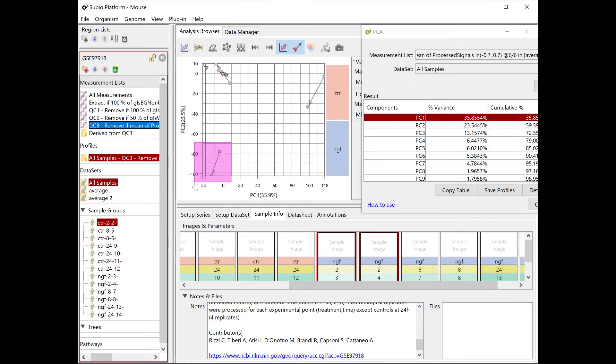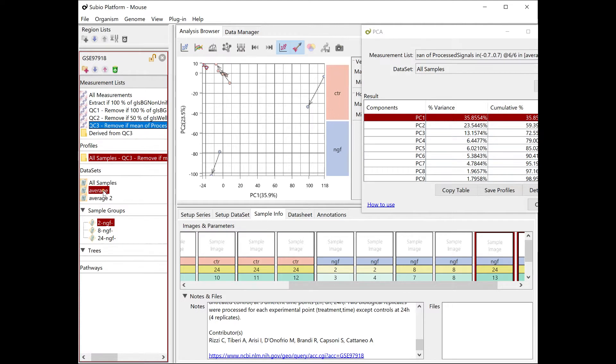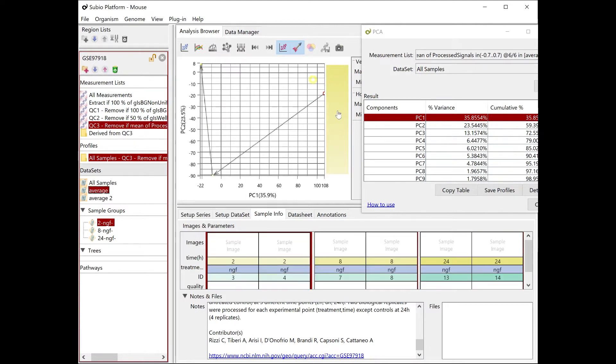The bottom two samples, which contribute to the second principal component, are eight hours after NGF treatment. And the twenty-four hour samples are near the origin.